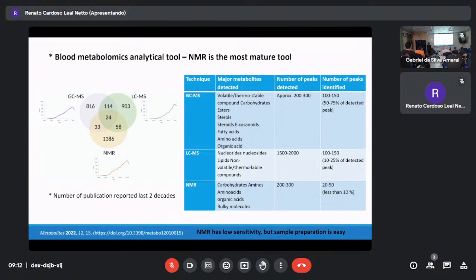They often use EI, electron impact spectra, which over several decades have accumulated all the data in libraries. A lot of metabolites are already there. You upload it and the result automatically comes out. The accuracy is not comparable, it's incomparable to LCMS.